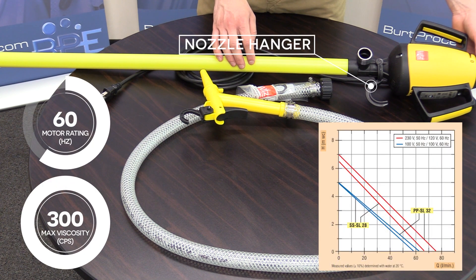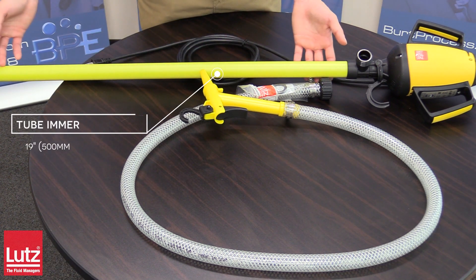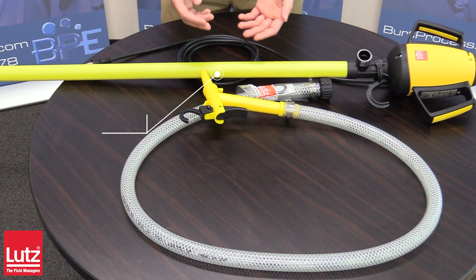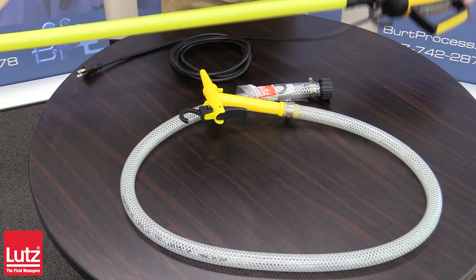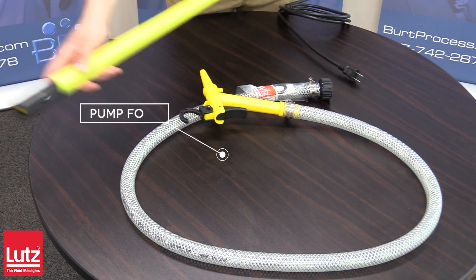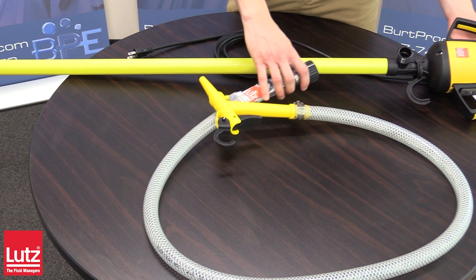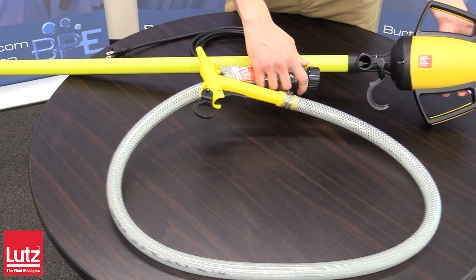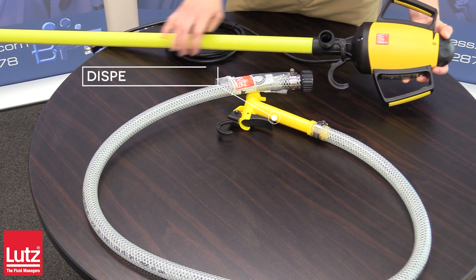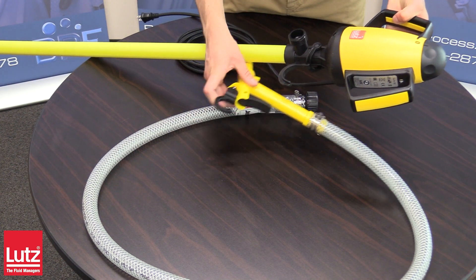The dip tube assembly and impeller, also available in polypropylene, features a chemically resistant plane bearing and a replaceable pump foot, as well as a mixed flow impeller and diffuser. The discharge nozzle and hose features a hand-trigger dispense nozzle, five feet and three-quarter inch PVC hose provided including hose clips and the wall bracket.